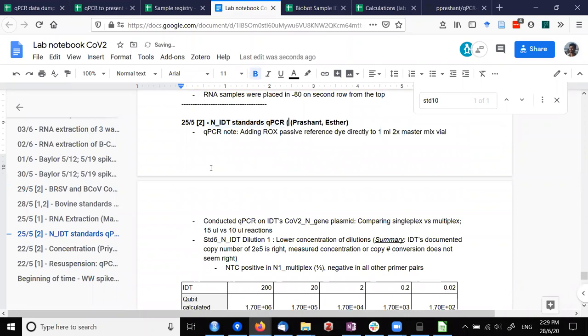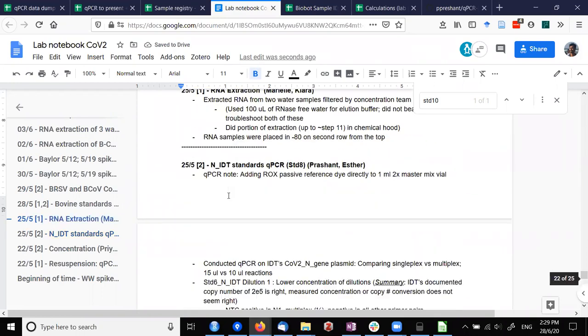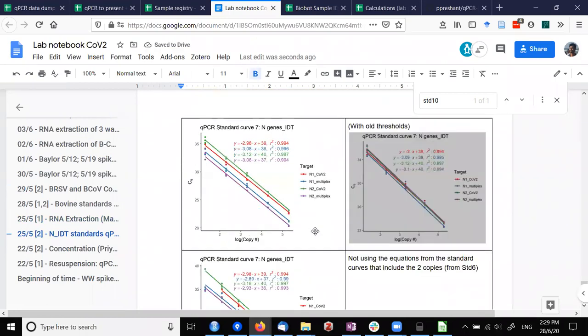Yeah. And then another question I have, in the methods meeting last Friday, there was a little bit of discussion about using RNA standards instead of DNA standards. Yeah. Do you think that they thought that was a better way to go, to use RNA? I guess we're switching to ddPCR, so maybe it doesn't matter. Yeah, so it doesn't really matter. Yeah, but yeah, I agree. I think we're switching over. It doesn't matter. I think it's true if we were really trying to get absolute quantification.